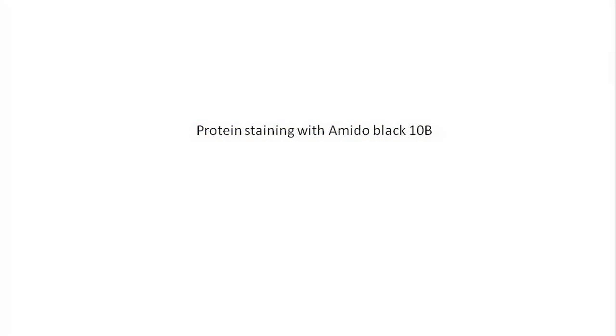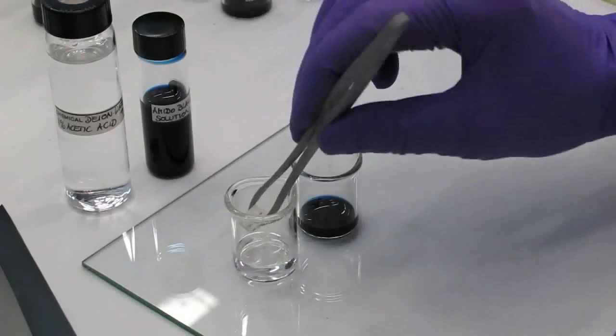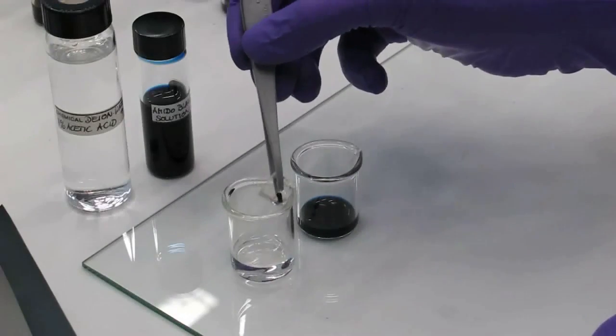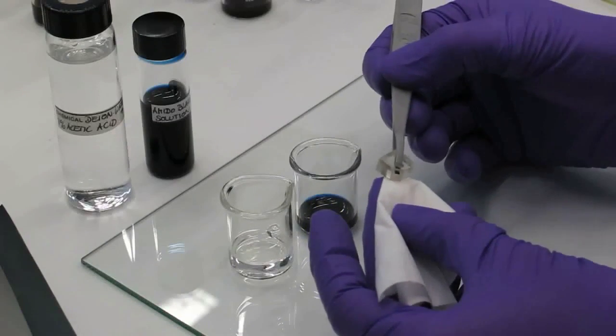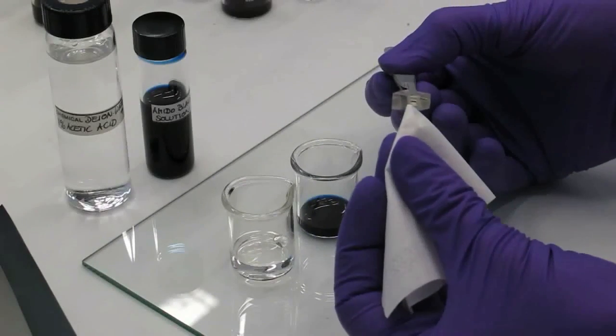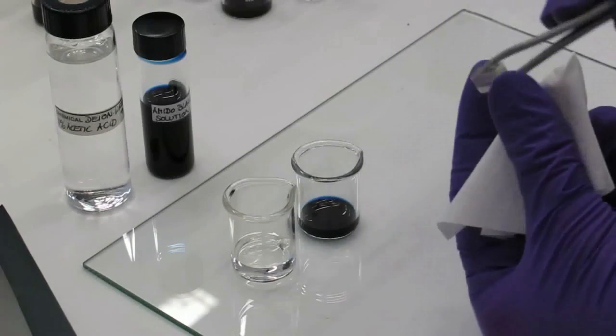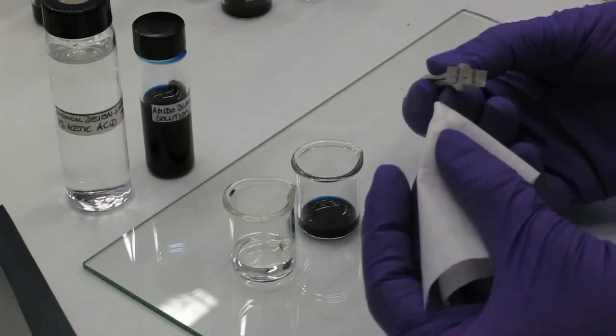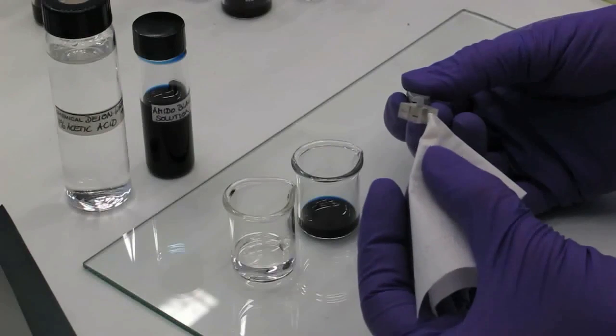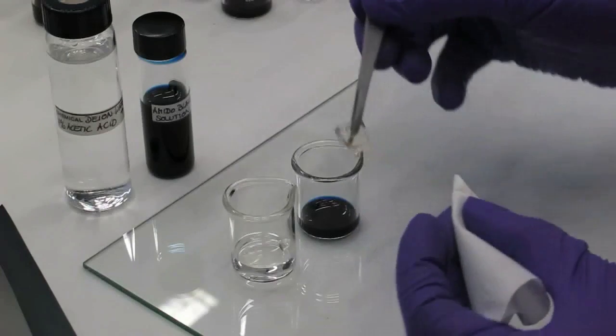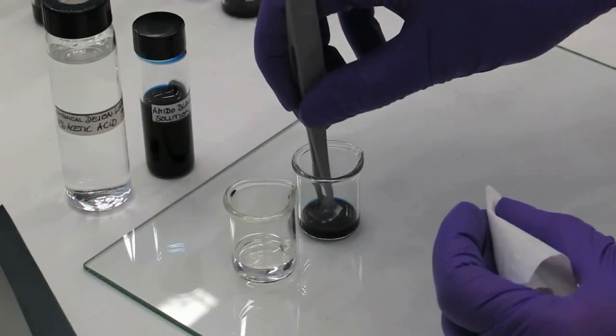In order to stain a cross-section with most of the histochemical stains, it is necessary to saturate the porous sample in the solvent of the stain to achieve saturation and to avoid penetration of the stain into the porous structure. Here, the sample cube had already been placed in the solvent bath. After five minutes of soaking in the solvent, it is removed with tweezers and dried with a soft tissue. As the cross-section of the sample might be slightly swollen and sensitive to mechanical action, any contact between tissue and the embedded sample surface is avoided.